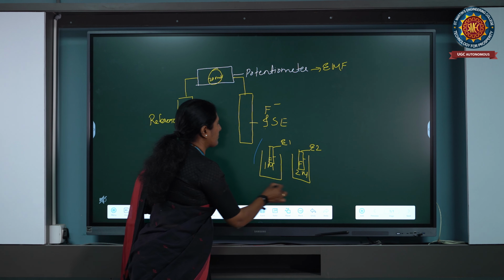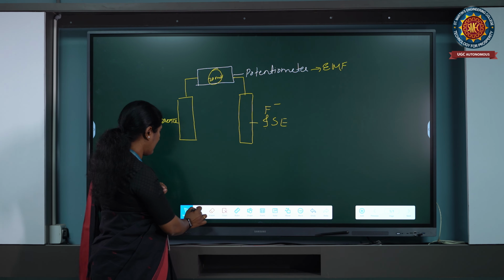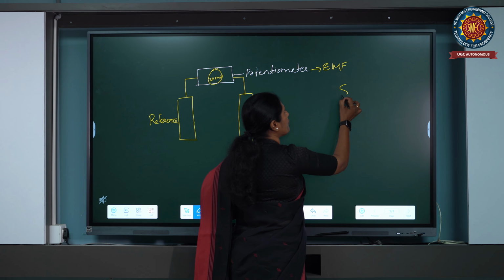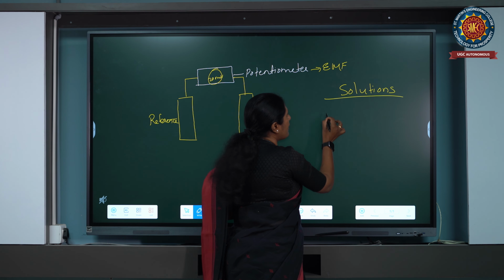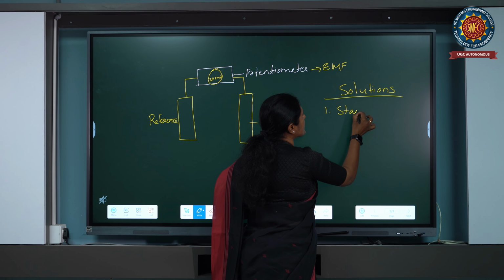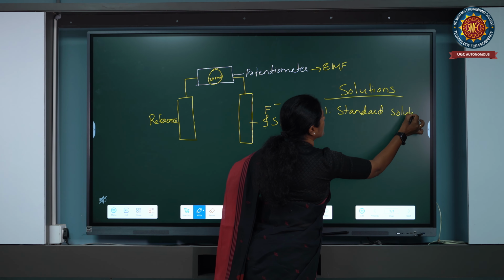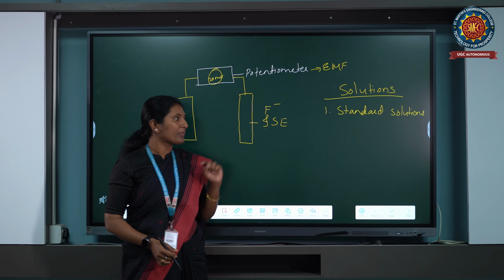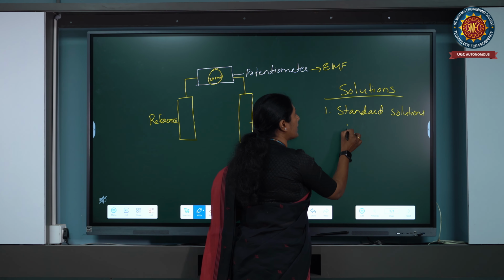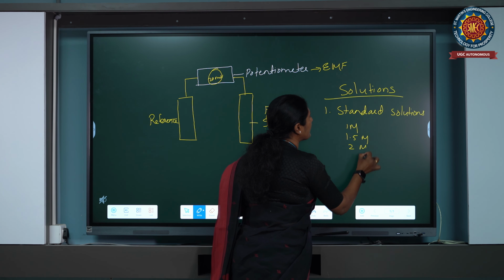Now, what are the solutions used for this experiment? First one is standard solutions. We have to prepare different standard solutions: 1 molar, 1.5 molar, 2 molar, like that.